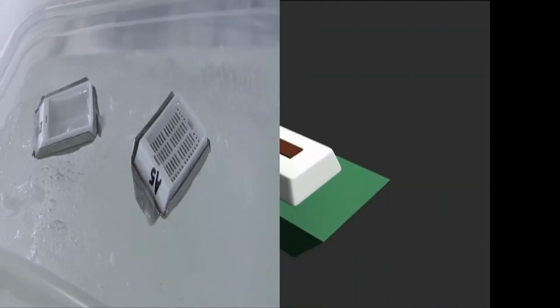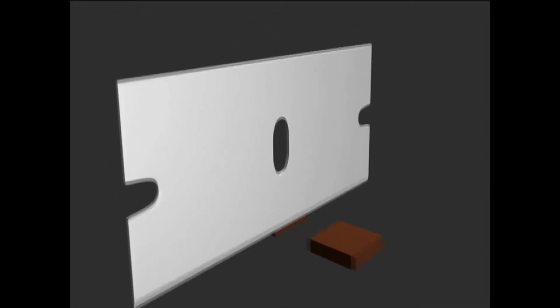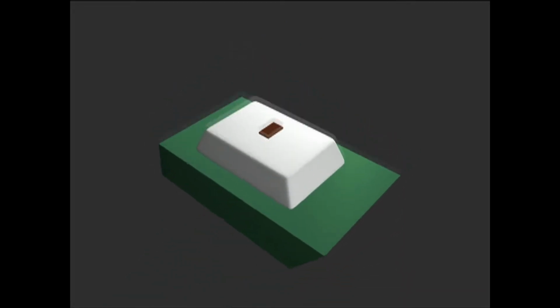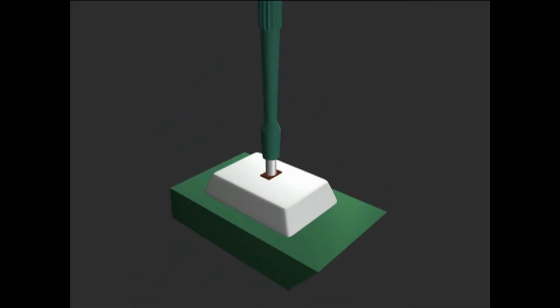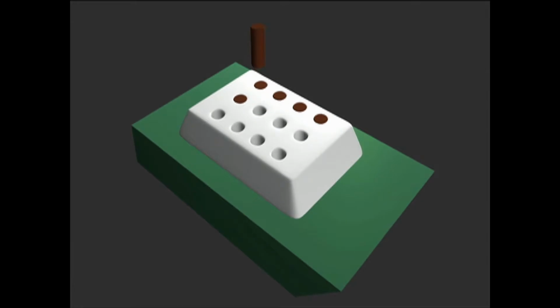Okay, let's do a quick recap. Remove the selected sample from the donor block. Cut it into usable sizes. Stand it on end. Re-embed them into a new block. Once the block is cooled and at room temperature, punch the block with the needle you are using for your TMA. In this case, it's the 3.5 millimeter needle, and then add the perpendicular embedded core to your TMA.